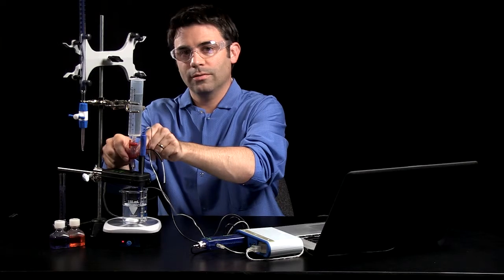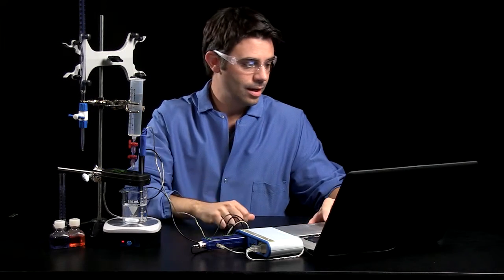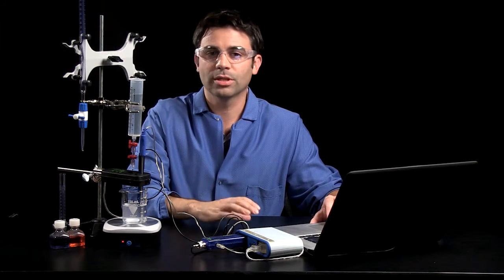Okay. I'm going to turn off the drop dispenser. And I'll stop data collection. Now we have a textbook example of a pH titration curve of a strong base with a strong acid. But we can go further with that.